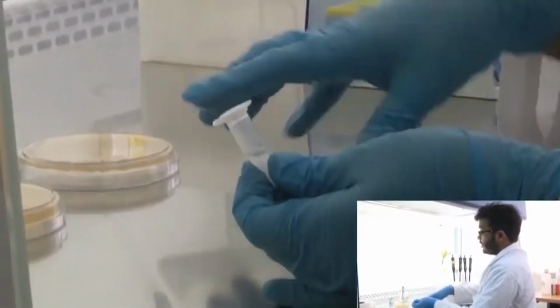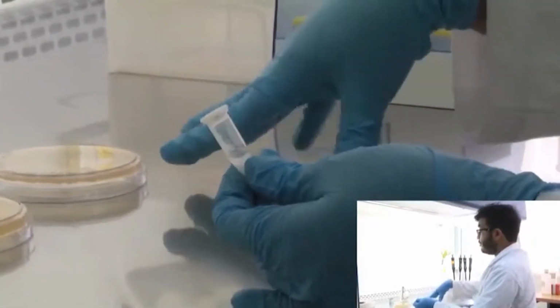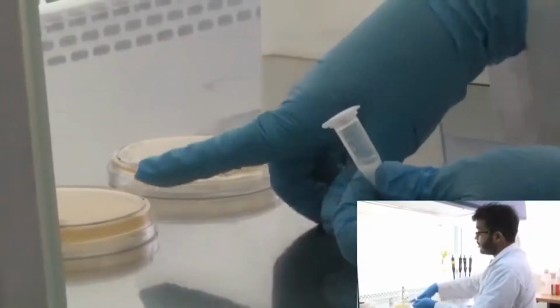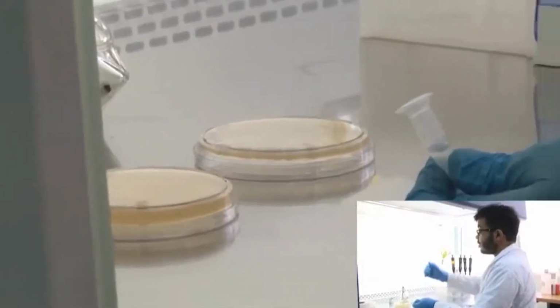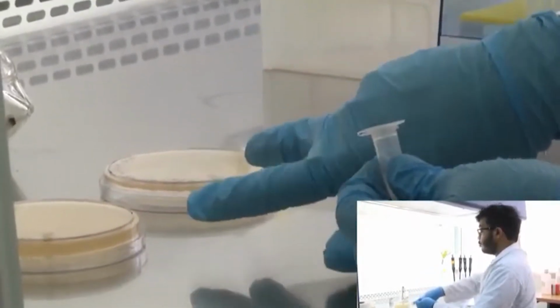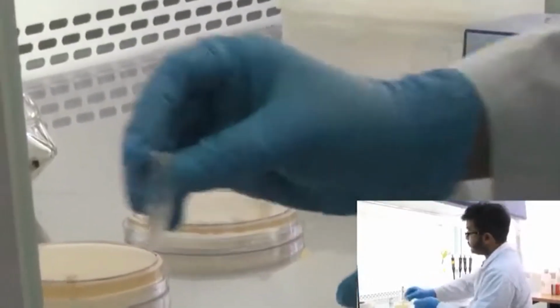In case transformation efficiency is very good, maybe in 200 microliter we might not be able to get single colonies. We will have a lawn of colonies, in which case in 20 microliters we will be able to get well dispersed and spread out colonies, which will help us to discretely identify separate colonies. For that reason, we are going to make 2 plates having a 10-fold difference in the amount of culture that is being plated.